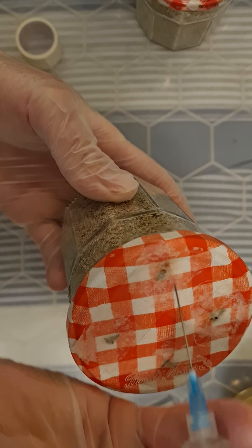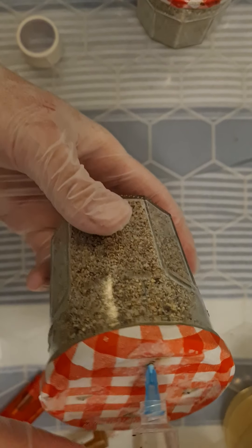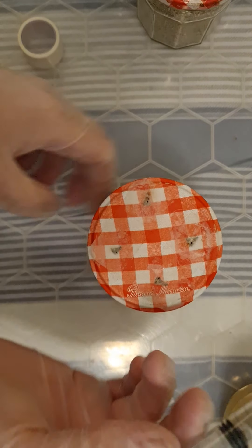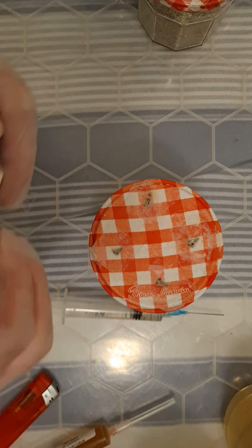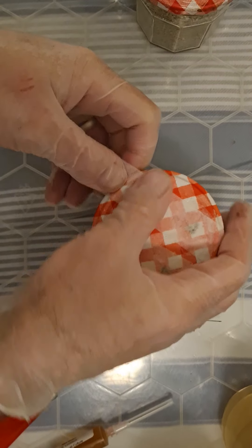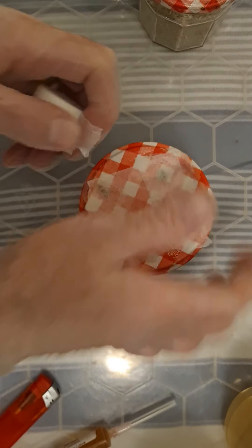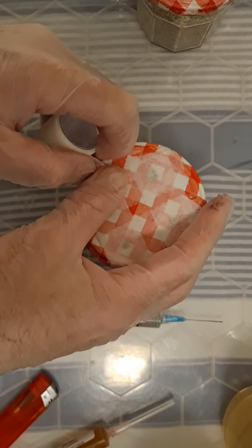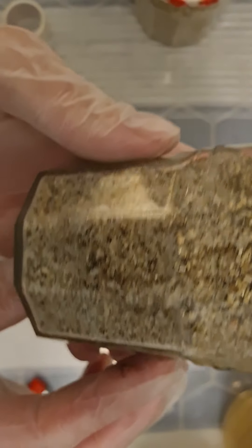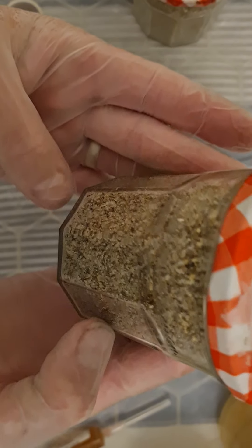There's a dry layer of vermiculite on the top — you want to get below that. Cover them back up with a bit more micropore tape. In about a week you should see where it's run down, you should see some spore germination.